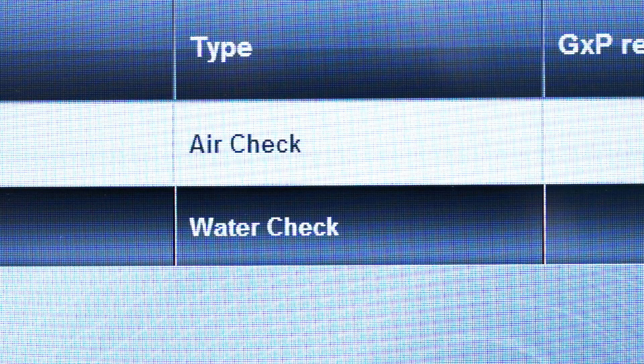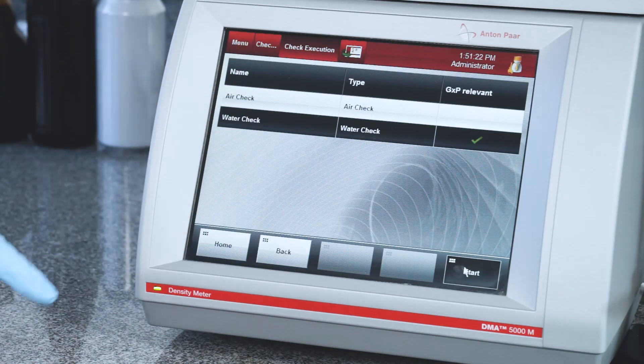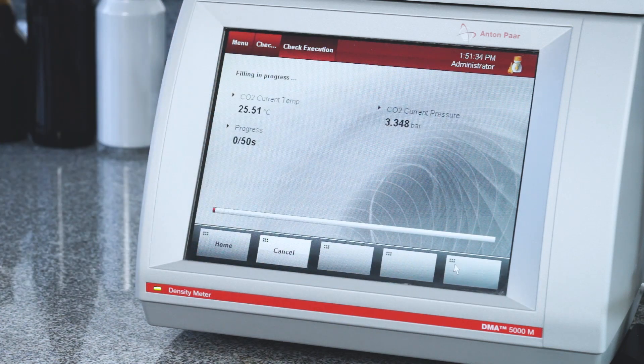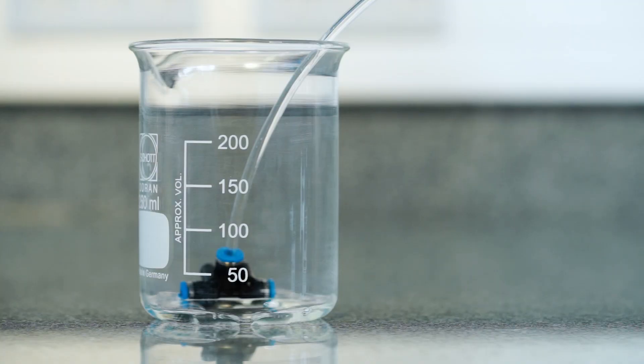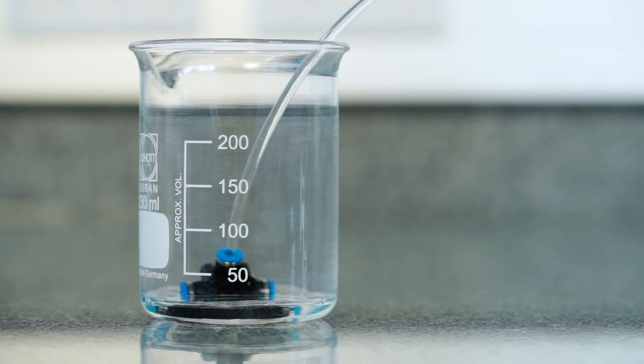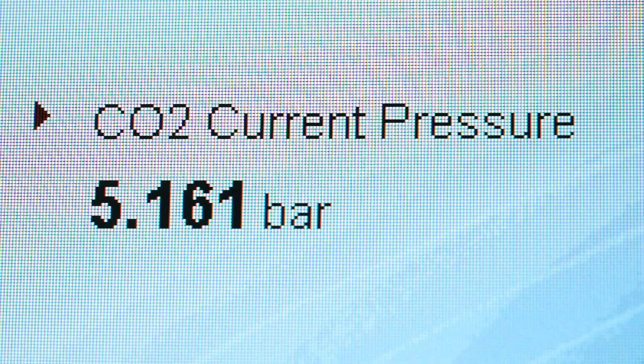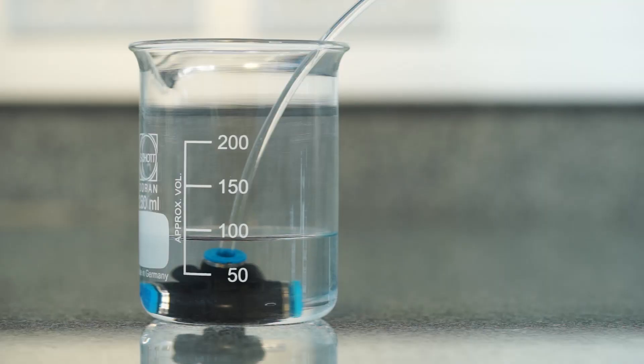Select Water Check and follow the instructions on the screen. While the water check is in progress, you can easily check the CO2 current pressure and the sample volume. The pressure shown during filling has to be at least 5 bar and the sample volume should be between 120 and 150 milliliters for a PBA-B system in its basic configuration. For each additional measuring module, about 20 milliliters extra need to be added.